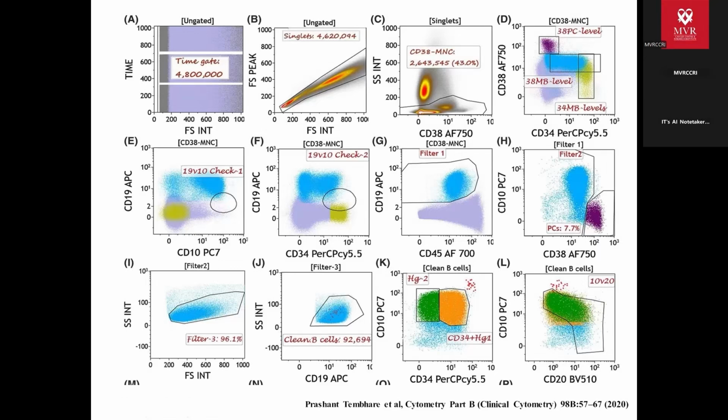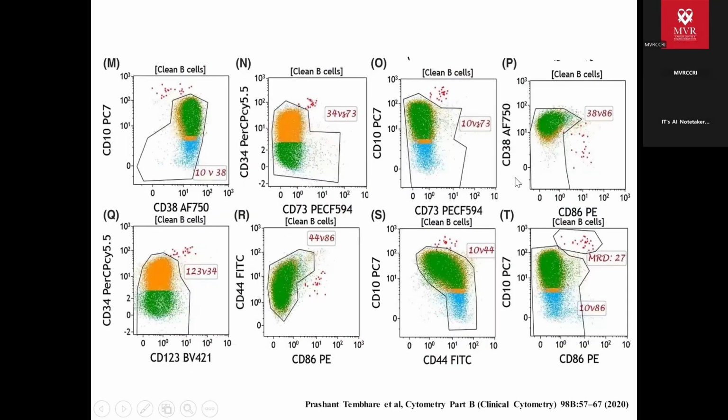And this filter, I then put it into my template of hematogones. These are the templates of hematogone. So in this template, what I've included is only CD19 positive cells. I've excluded my myeloid, excluded my plasma cells, and other unwanted cells which I don't want to see. Okay, so this is a gating strategy that we have established for BMRD.